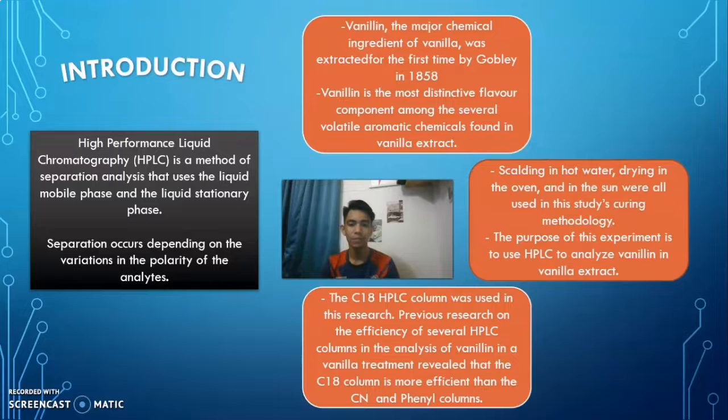The C18 HPLC column was used in this research. Previous research on the efficiency of several HPLC columns in the analysis of vanillin in a vanilla treatment revealed that the C18 column is more efficient than the CN and phenyl columns.